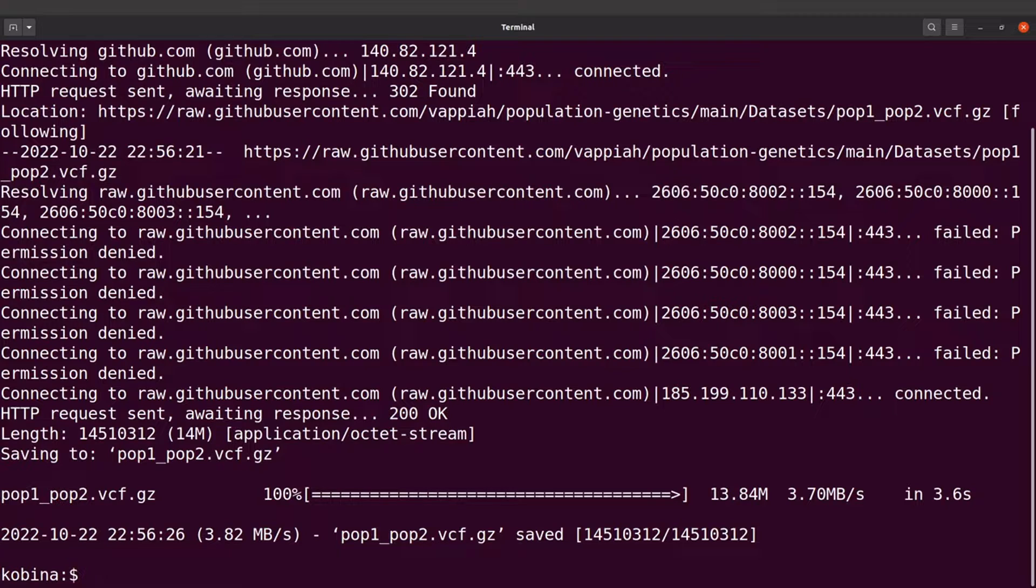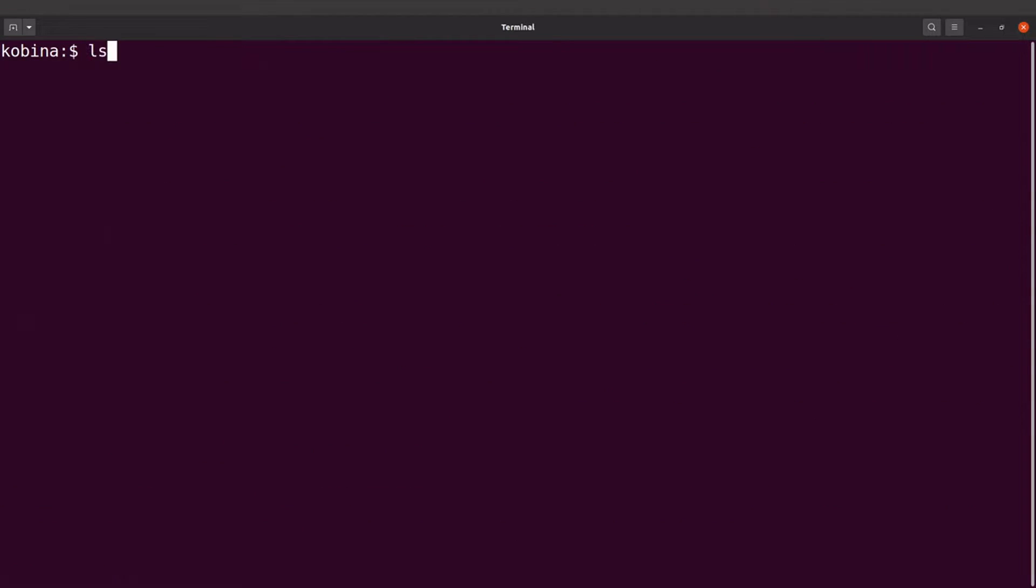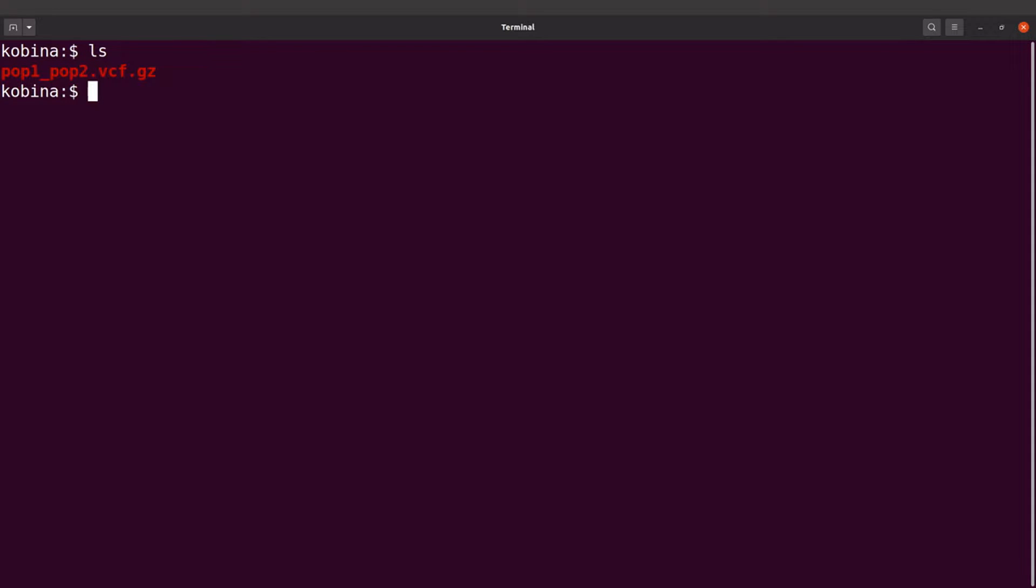Okay so download has been done, let's check the file. So if I do an ls I'll find the file here. Okay so this is the VCF file that I'm going to use. Perfect. Now we are going to explore this VCF file.